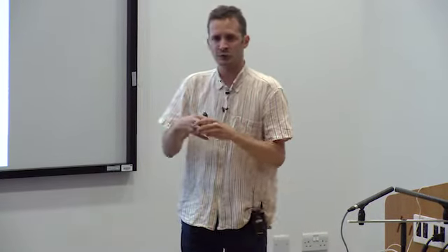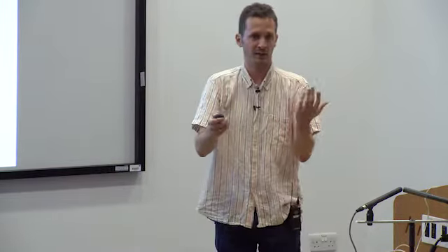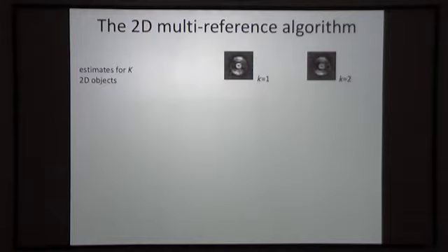And then I told you I would come back to what you start with as the initial guess of the blurry 2D, two-dimensional penguin. For cryo-EM images, it turns out that this algorithm is robust enough. We can start from initial random orientations for all the individual particles, and then we get a blurry disk, which will be our initial guess of that penguin image. In this case, these were large T antigen projections.